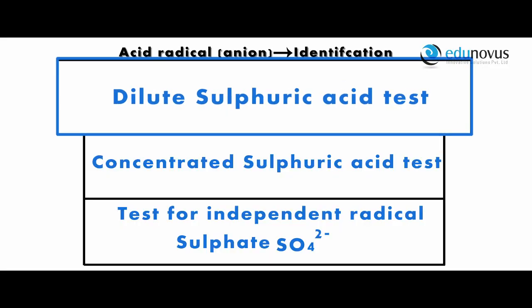Dilute sulfuric acid test: in this test we take a small amount of the salt in a clean and dry test tube and add few ml of diluted sulfuric acid. Let us see the action of diluted sulfuric acid on the salt.